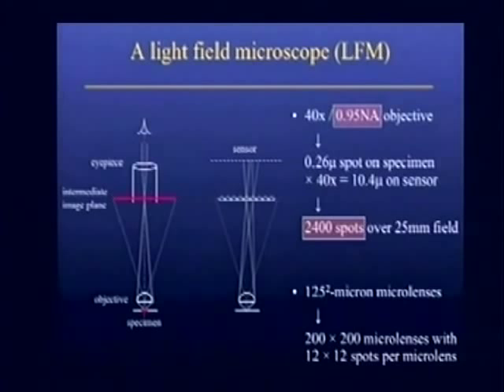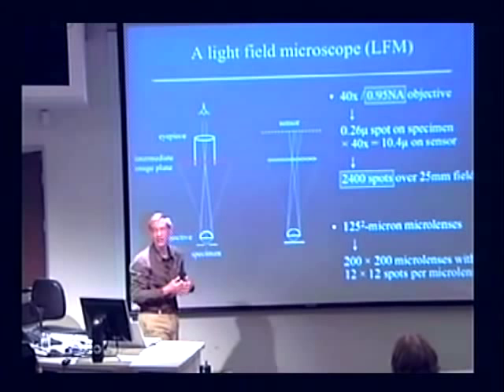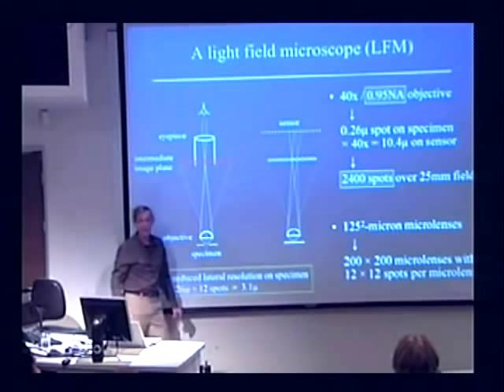So another way to think about this is there's a propagating wavefront coming through the microscope, and there's an information content of that propagating wavefront. And the discoveries of Fourier optics tell us that we cannot exceed the information content of the propagating wavefront. We are free only to interpret it as spatial or angular resolution, but we cannot exceed it. So the first thing I have to tell a microscopist is if this is the partition they chose, then they're going to get about 3 micron things they can resolve instead of 1/4 micron things that they can resolve.